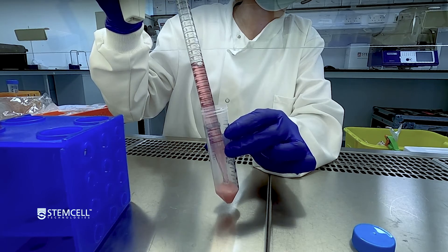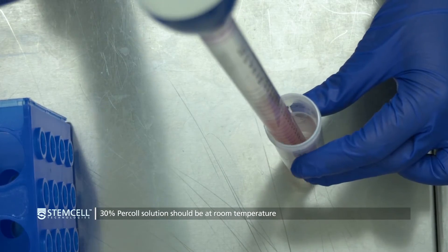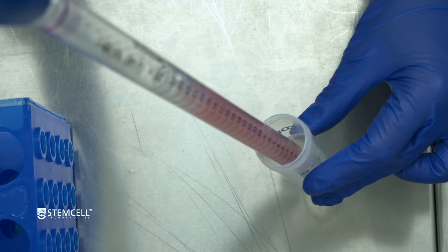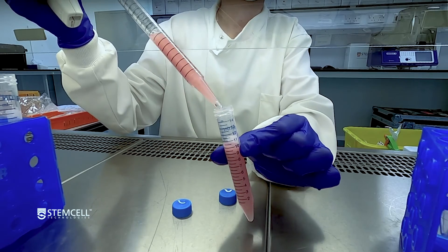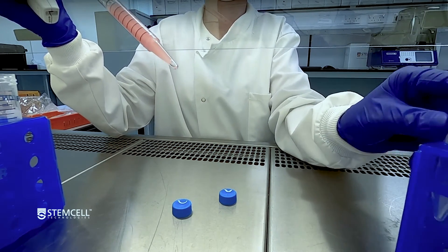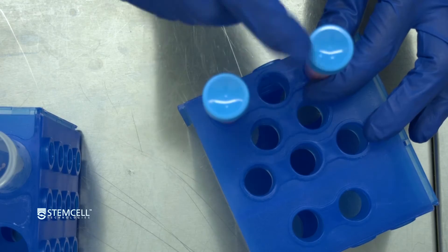Add 6 milliliters per brain of 30% Percoll solution to the pellet. Mix gently and transfer to an appropriately sized tube. For volumes greater than 30 milliliters, use 50 milliliter tubes. For volumes less than 30 milliliters, use one or more 14 milliliter tubes.